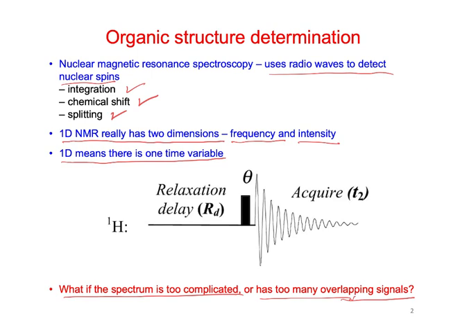Here's drawn out a normal pulse sequence for a one-dimensional spectrum, and our time period is this acquisition time. Even though we only have one here, we're calling it T2 because that's what we'll call it in the next spectrum as well. Remember, we had this relaxation delay to allow signals to relax into the plus Z direction. We pulsed it, tipped everything down into the XY plane, they precess, and we measured the precessional frequencies.